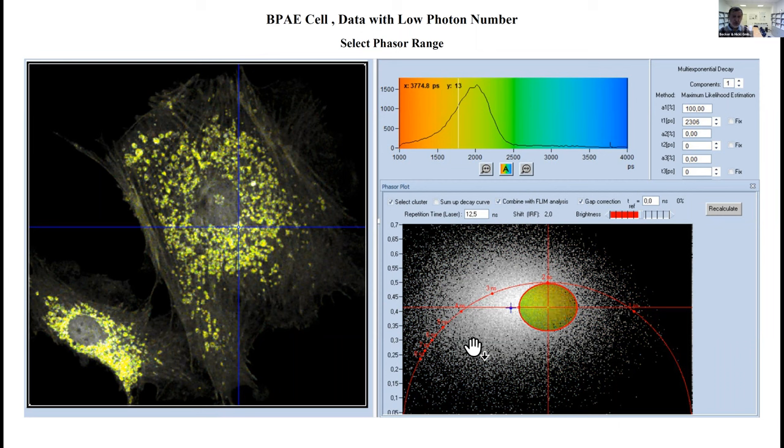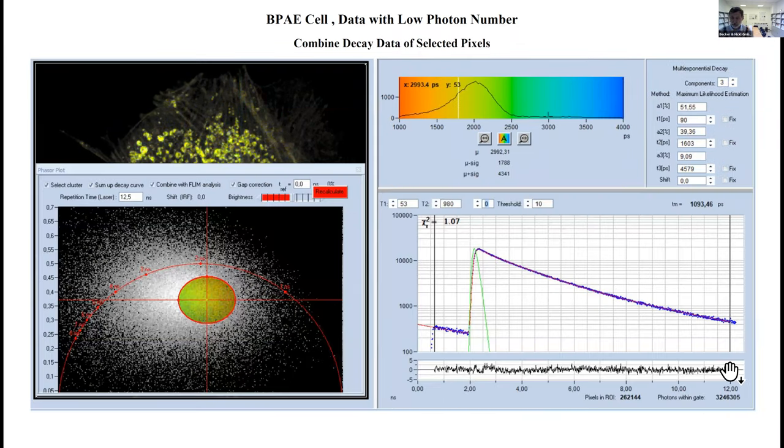Back-annotate the selected pixels in the time domain image, and sure enough we are selecting the mitochondria. That's good. In the next step we sum the decay curves of all pixels which we have selected up, and we get a beautiful fluorescence decay curve which contains more than three million photons compared to something like 200 in the individual pixels.